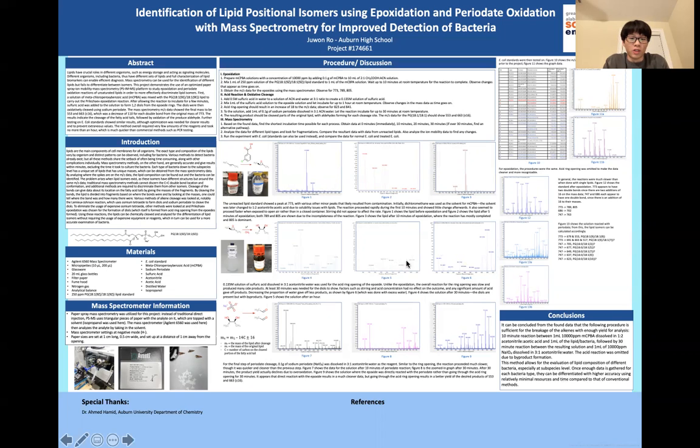I don't know if you can see clearly, but while the diols did form, so I can see values of 807, 823, 841, all of which are diol data, which is good, there were too many byproducts, which led me to omit it in the end. But anyways, this was the result.